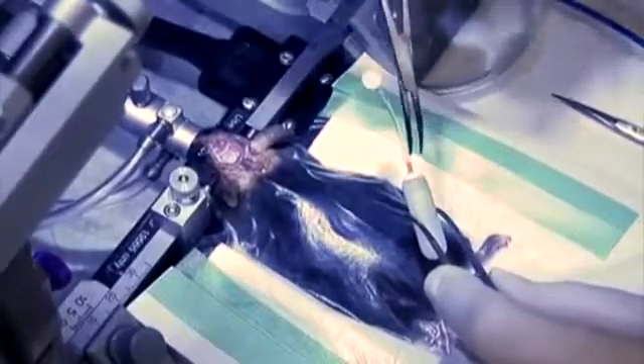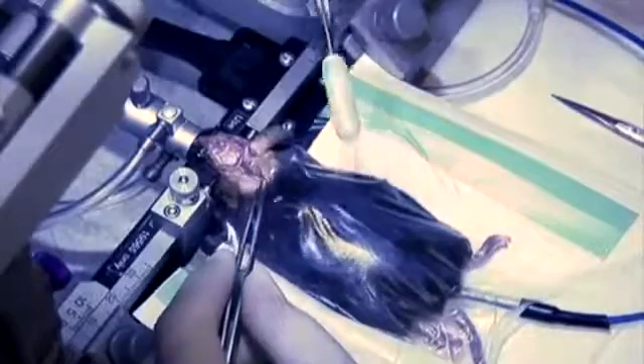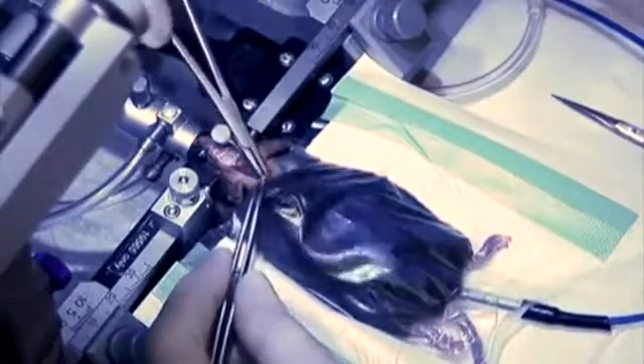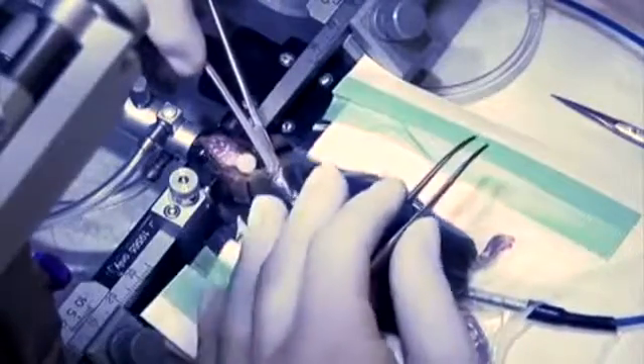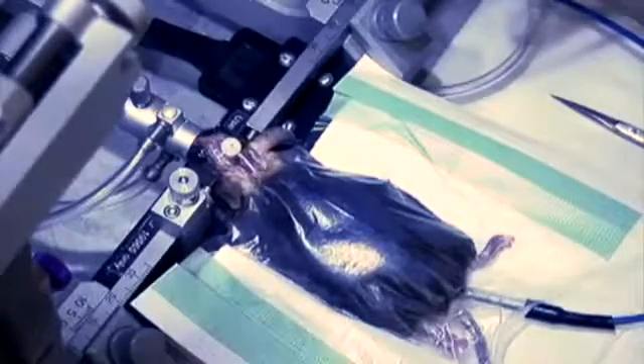Use a curved hemostat to hold the pump where the flow modulator and tubing meet. Insert the pump under the skin at the base of the neck and carefully push it back toward the left hind limb as far as it will go without resistance.